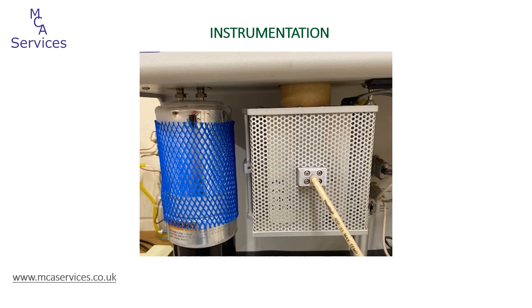The final setup on the instrument shows the slush bath or cold trap installed on the left-hand side, and on the right-hand side is the sample furnace, which we've now closed with the sample tube located within it. We're now ready to start the analysis.